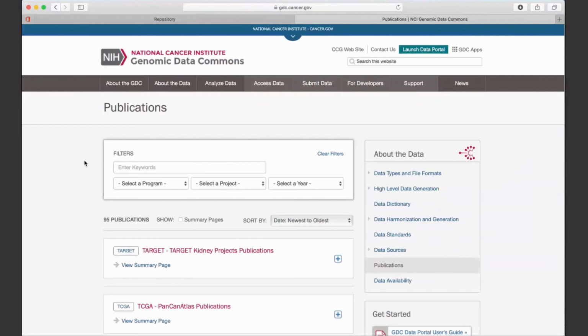One is Indelocator for finding indels, and the other is a caller called RADIA, that has the option not only to use tumor normal pairs from DNA-Seq, but also can take a third RNA-Seq BAM. So we have a different set of callers, but a lot of the downstream processing, including filtering and aggregation, are very similar.